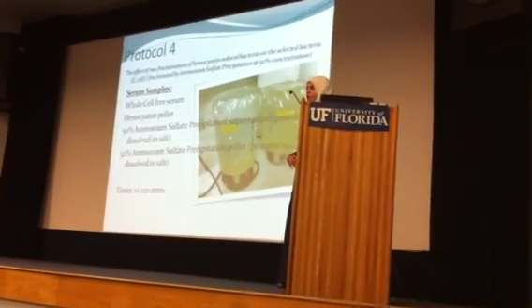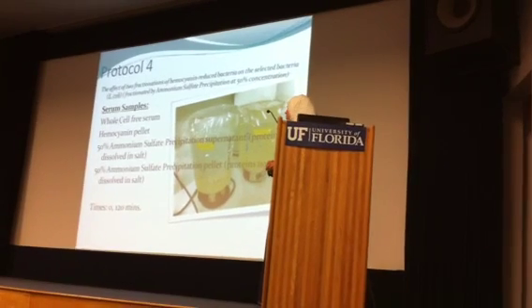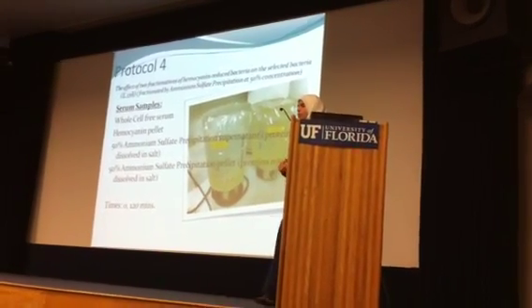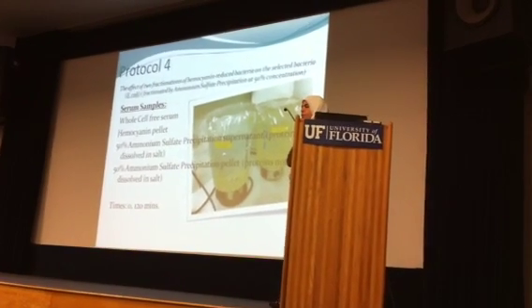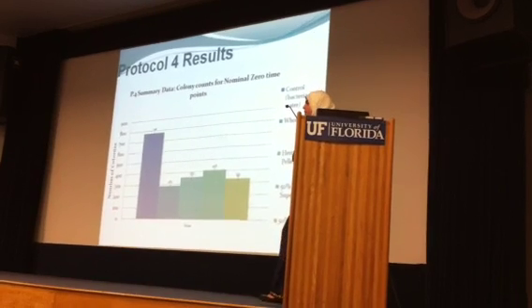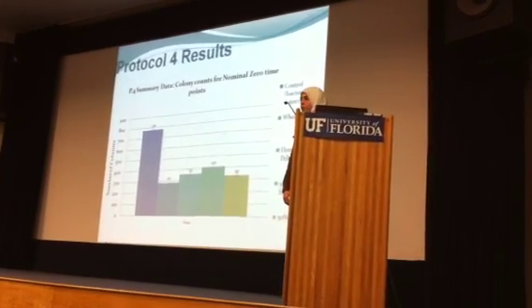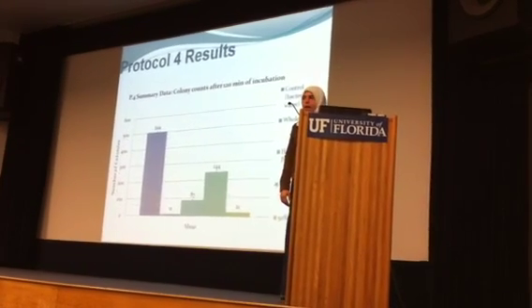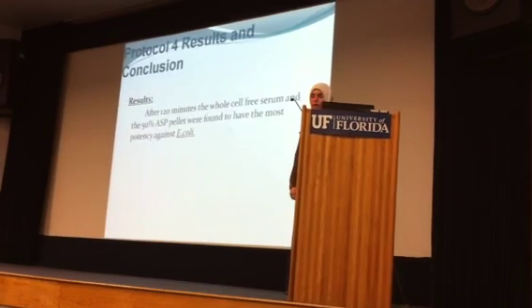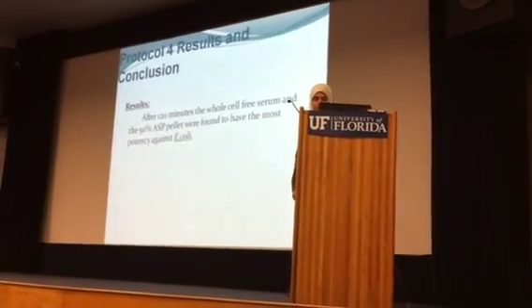And in my fourth protocol, I used ammonium sulfate precipitation, which is a salting out method, in order to divide the proteins. And so I had a 50% supernatant, which were proteins dissolved in the solution, and a 50% pellet, which were proteins not dissolved in the solution. And at nominal time 0 compared to water control, the whole cell-free serum and the 50% pellet had the greatest reduction, and after 120 minutes, the number of bacteria further decreased. Therefore, I found that the ammonium sulfate pellet had the greatest inhibition of bacteria.